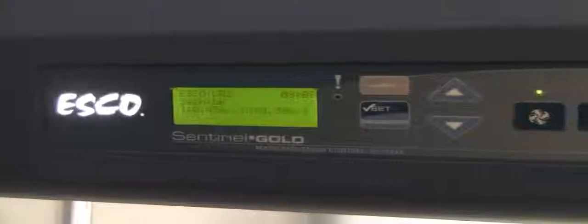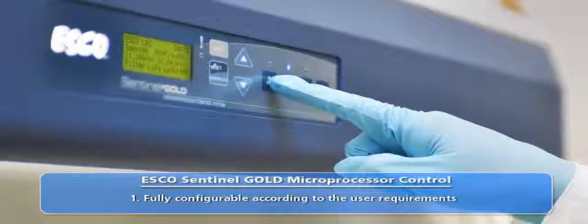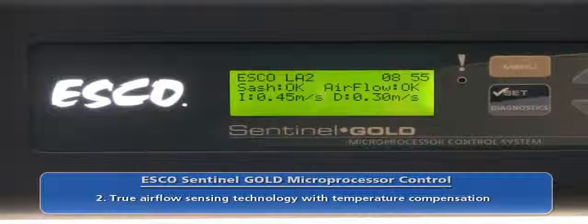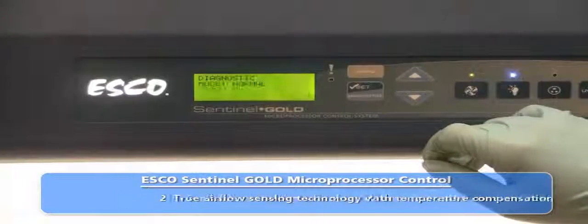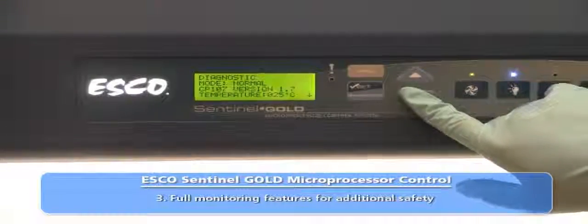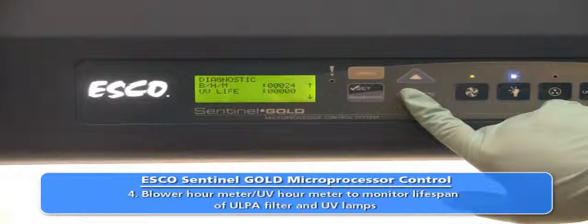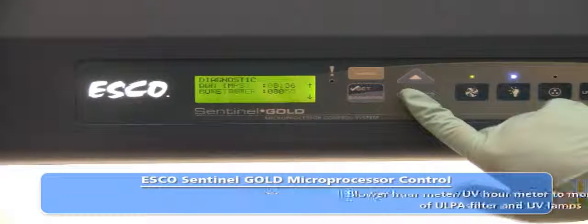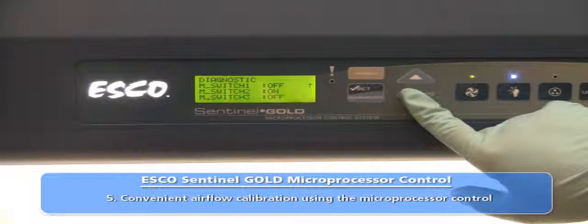LabCulture Class II Type A2 Biosafety Cabinets are equipped with the Sentinel Gold microprocessor control system. All control features and functions may be configured to suit the user's requirements. Cabinet air velocities are continuously displayed on the LCD screen. The Sentinel control provides intelligent hardware diagnostics and generates error message reports. The control system monitors blower usage hours to gauge filter lifespan and to alert the user when a replacement is required. Cabinet airflow velocity settings may be calibrated directly from the microprocessor control system.